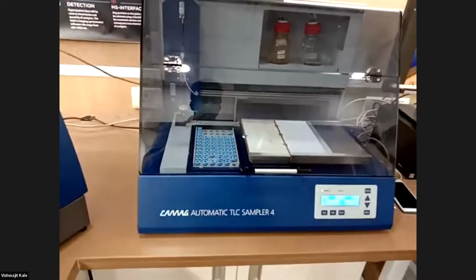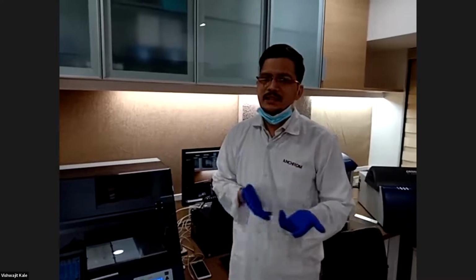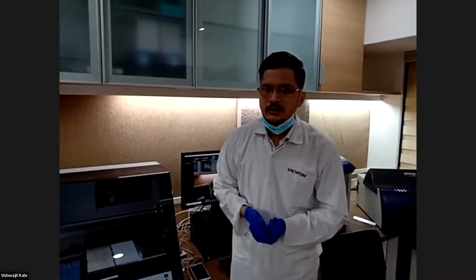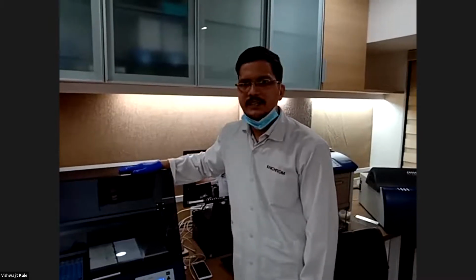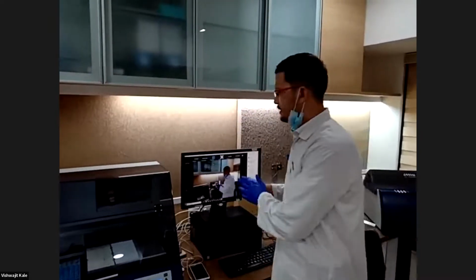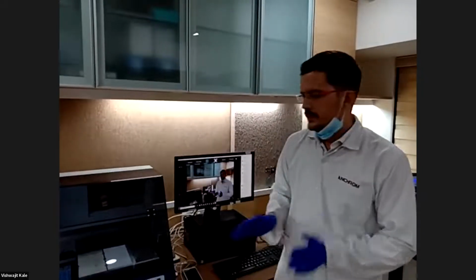There is another sample applicator which is semi-automatic, where we need to rinse and fill the syringe in between manually. Otherwise, again, it can operate through software also. So this is ATS4. We will start sample application shortly during the demonstration of the software. So I will start that later on. We have kept the plate ready for sample application.